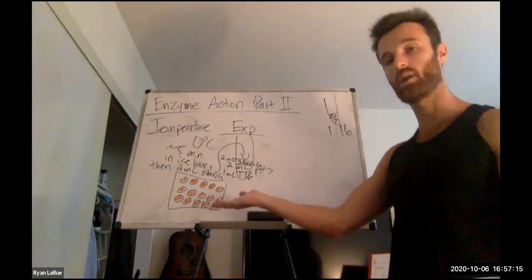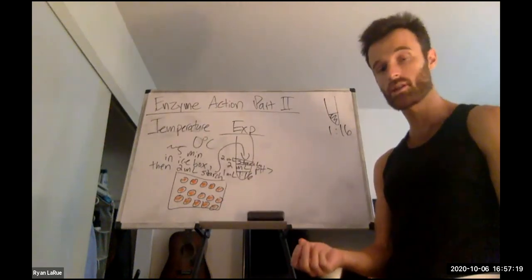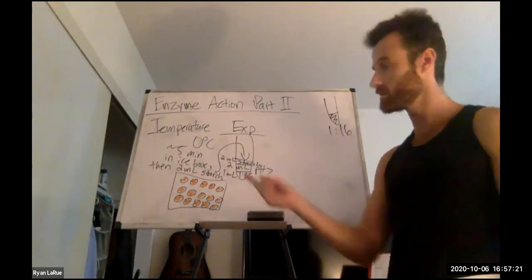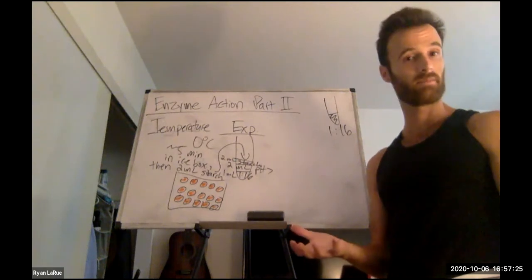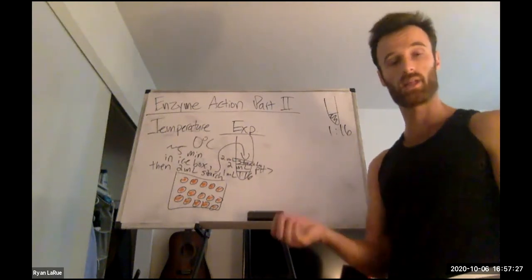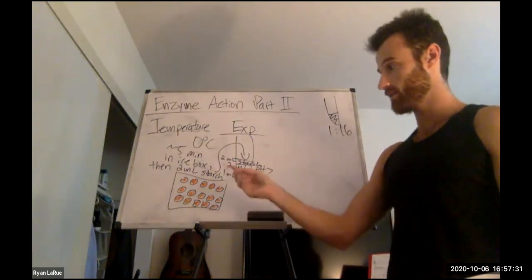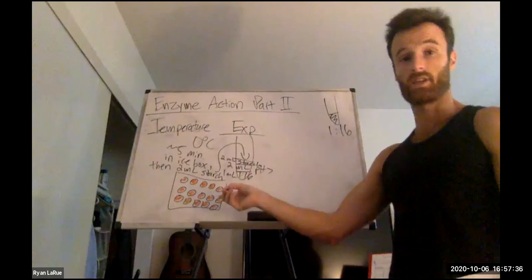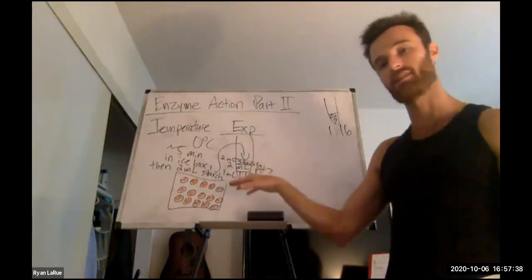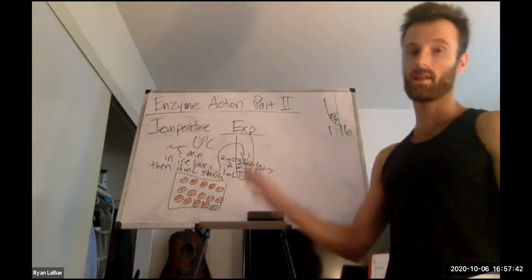And you see that on the well plate. The enzyme works. If it's breaking down starch, you're going to see that color change. Because remember, the Lugol is identifying if starch is present. If it is, it turns blue-black, and the enzyme's not breaking it down, right? If it doesn't change colors, this lab is really backwards and tricky. If it doesn't change colors, then starch did break down and it isn't present.